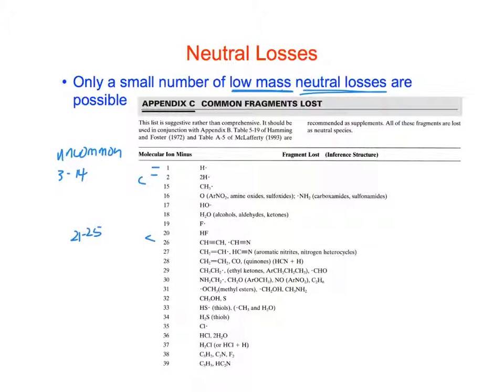Okay, so there's just not easy ways to lose those masses. So we should see losses that are common, or logical at least.